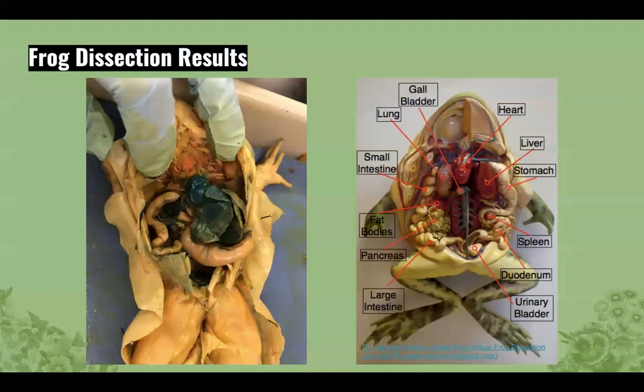In this slide, you can see a comparison of our frog dissection on the left compared to another frog dissection, which shows all the organs that are labeled.